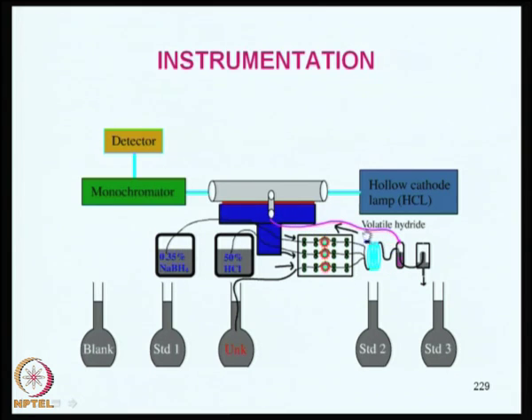I am showing it, this pink line is how the sample enters the hydride, and this is a T tube of quartz, and this tube will be introduced on the flame.